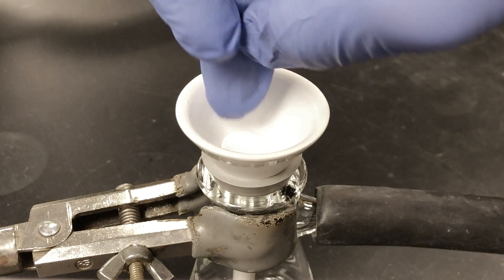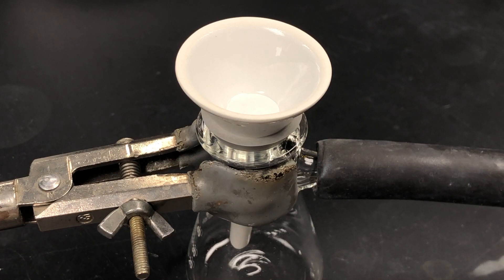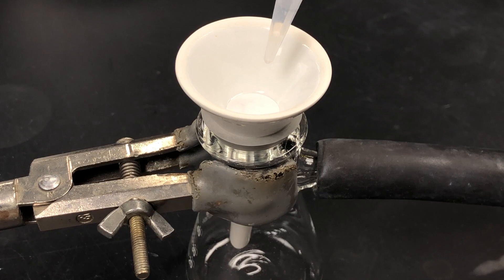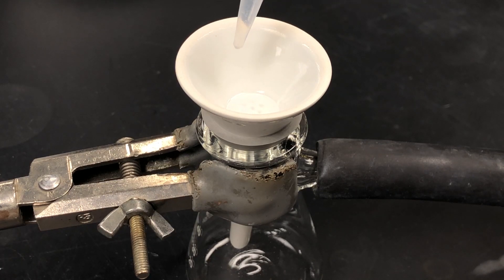Before you begin, make sure to wet your filter paper with a few drops of whatever solvent you are using for that experiment. This will create a seal between the filter paper and the funnel. If you skip this step, you may lose some of your solid under the filter paper.